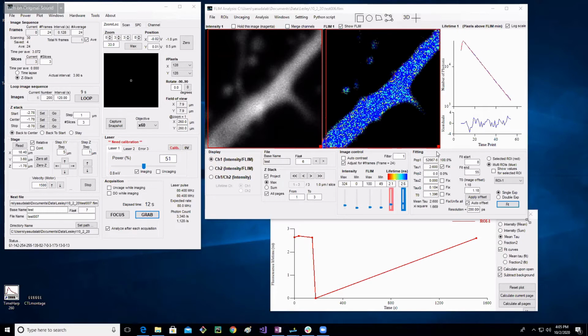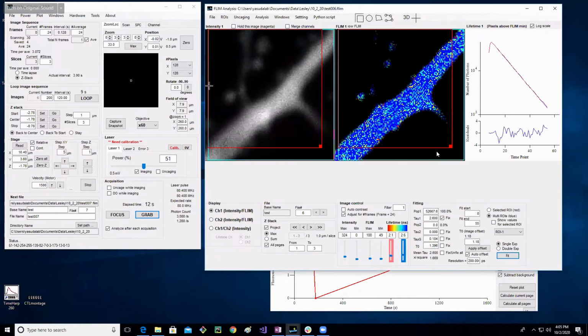Okay, so when we talk about a frame, since this is a point scanning laser imaging program, the laser is going to go through this image and scan across this whole line, pixel by pixel, all the way through one rectangle, and that is called a frame, one rectangle. You can basically average a bunch of frames together, have it repeat this process a bunch of times and average them together.